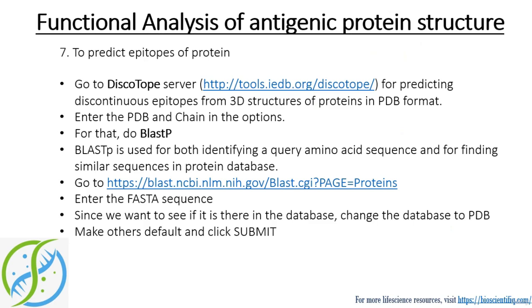Okay, so for that we need to enter the PDB and chain in the options when you go to Discotope server. Okay, we'll be going to that, but we need to have the PDB and chain for it, right? So for that you need to do the BLAST P, or you can say protein blast, which is used for both identifying a query amino acid sequence and for finding similar sequences in protein database.